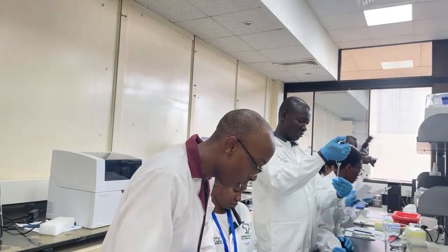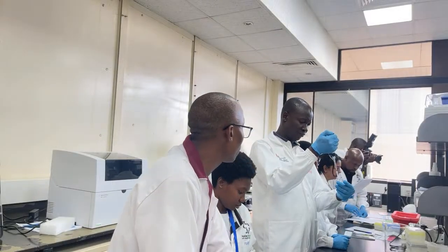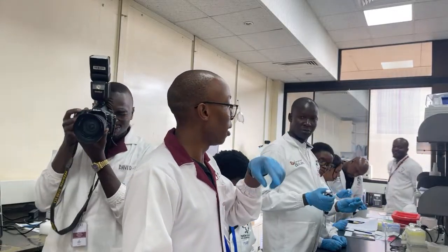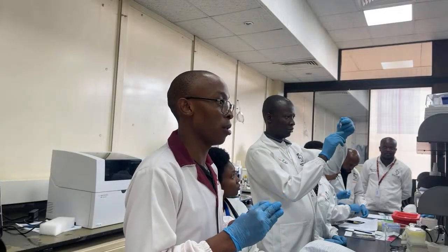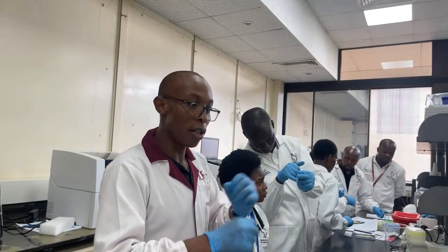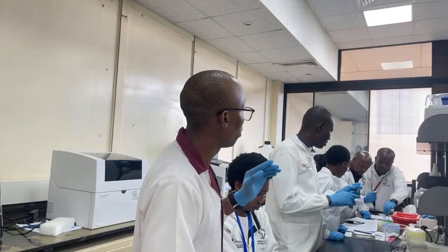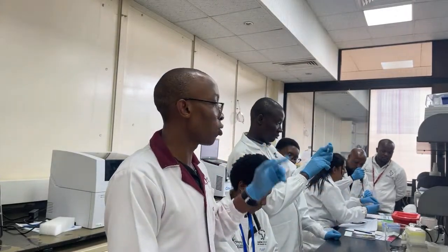Just kind of when you're at the top of the isopropanol, that's where it starts precipitating. Are you noticing any cloudiness? I want everyone to add the BL3 buffer first, and then the next step is to add a disc into the solution. Your DNA will start wrapping itself around that disc, and then you see it precipitate once you add the isopropanol. You add the BL3 to the supernatant, not the original pellet, the supernatant.